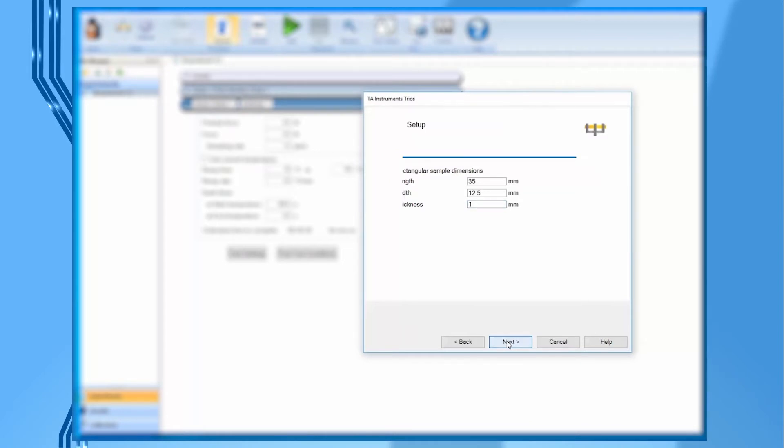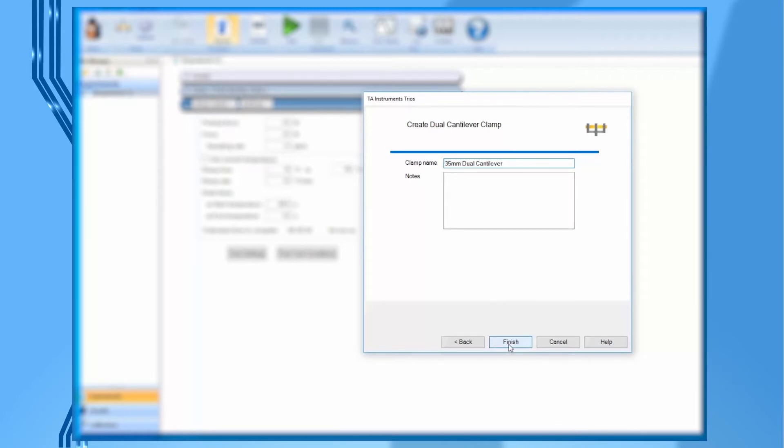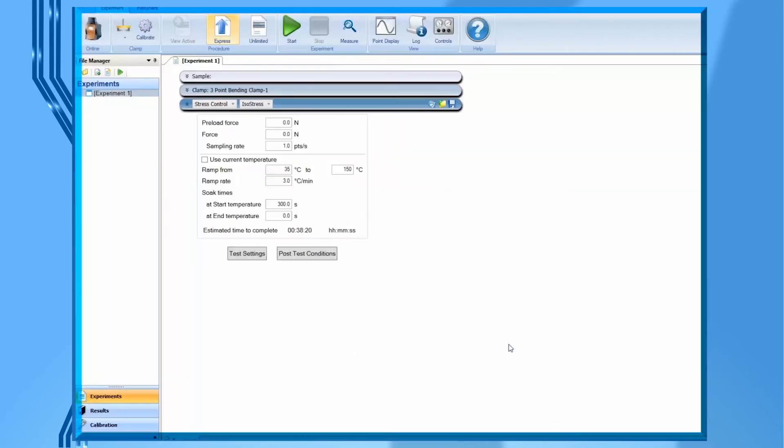Specify the name of this clamp by entering 35 mm dual cantilever. Click on finish to create this clamp file. Then TRIO will automatically lead you to perform the clamp calibration.